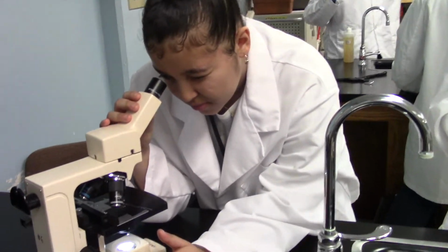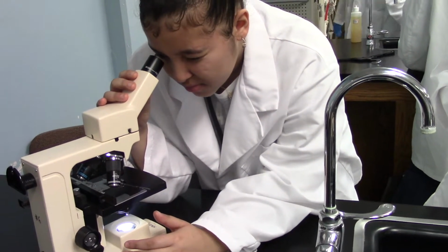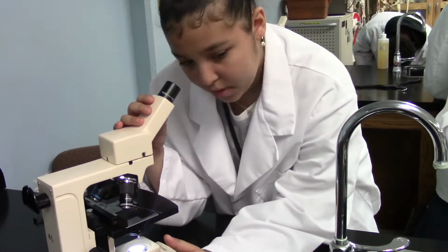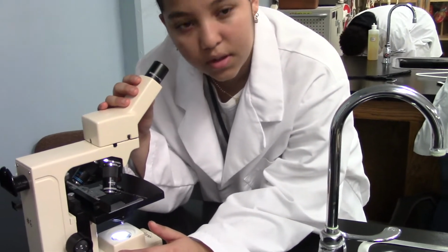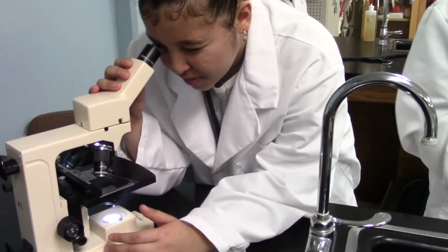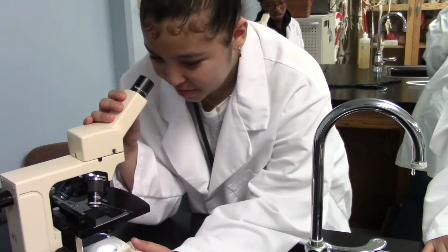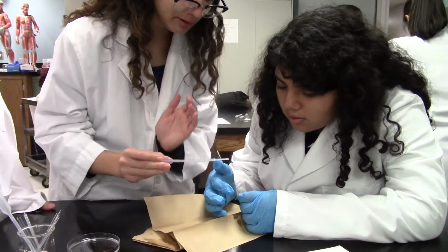And she's going to count. It was 15. Let's see if it goes up or down. When you see it push, remember Miss Hempel said earlier, you're supposed to focus on one. Do you want him to count again? Yeah, probably should do the same counter for each worm. Oh, okay, no. Put it down, put it down.